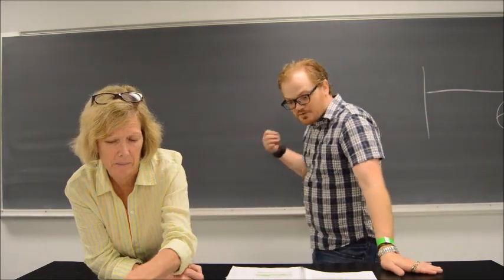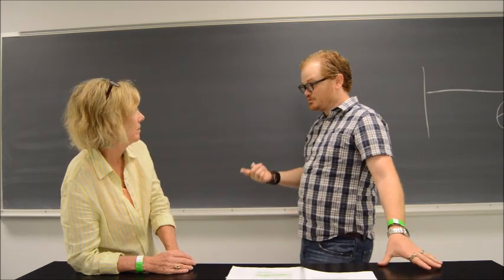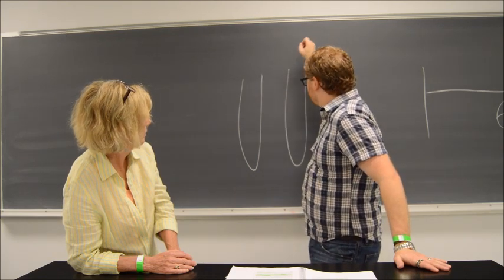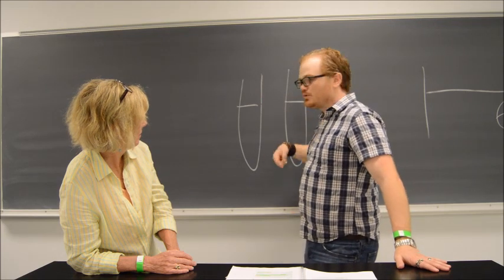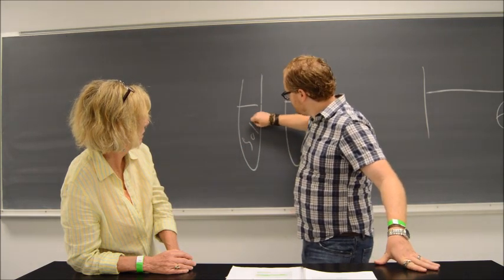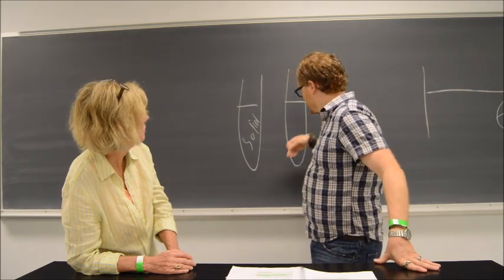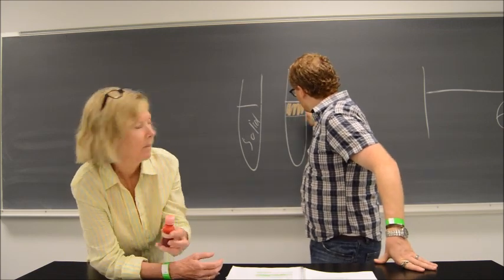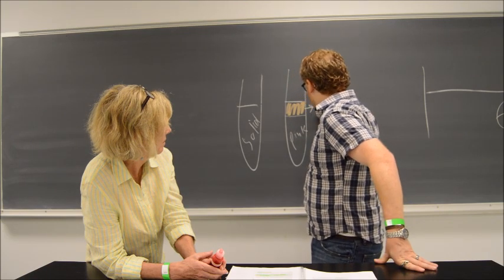Okay. So a very important concept to recognize when we're doing this is the way in which the test tubes look once the test has been run. So if you're running this, here's two test tubes. Here is our line at the top. This is air and this is liquid. When you run a Sudan test on this, what you tend to end up with is a solid color if this is a negative. And if it's positive, what you're going to see is a line like this. This is going to be kind of a pink, and this is going to be more of a deeper red.